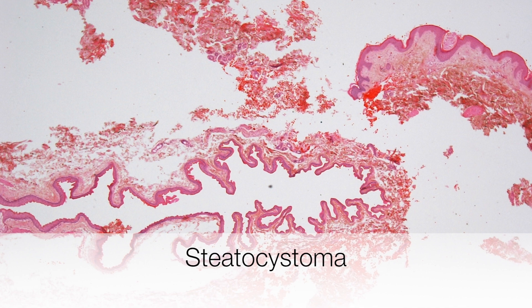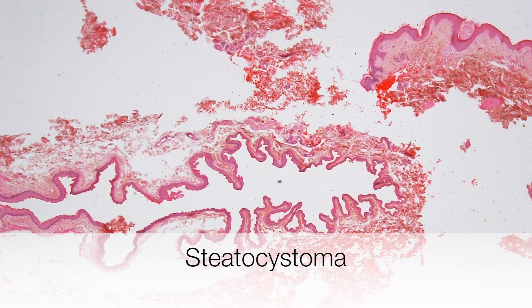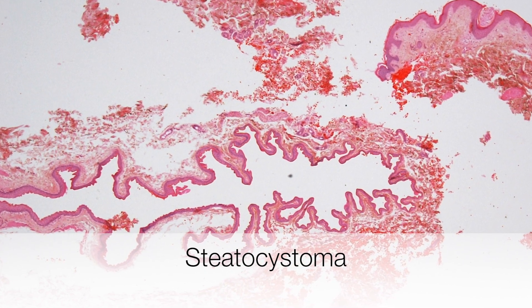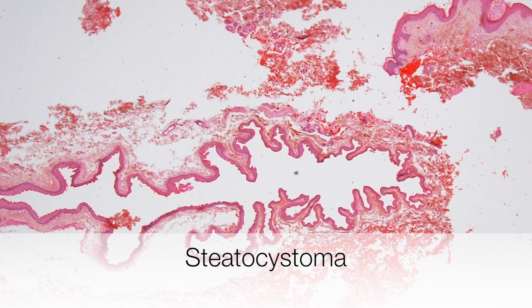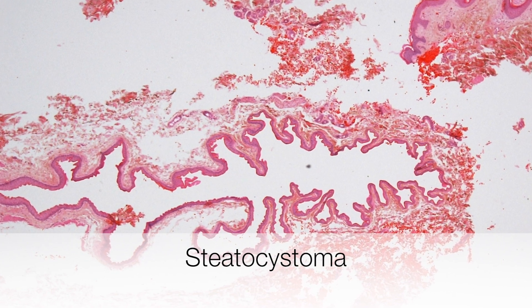This is a low-power overview of a steatocystoma showing a cystic structure with a rather corrugated lining.